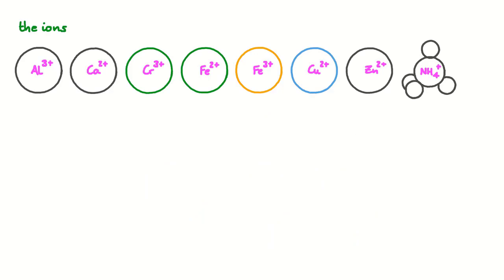We'll only be looking at some of the most common ions you might find in solution in the lab. There are, of course, many more cations than this, but this selection shows an interesting range of responses. If you use your detective skills, you may be able to figure out which one of these there is in a particular solution. Now, let's meet the ions.